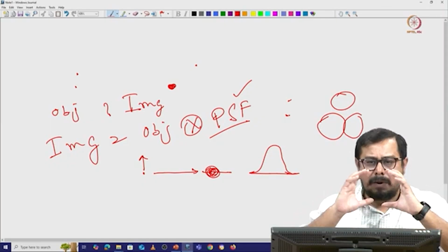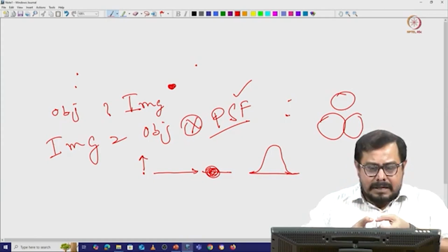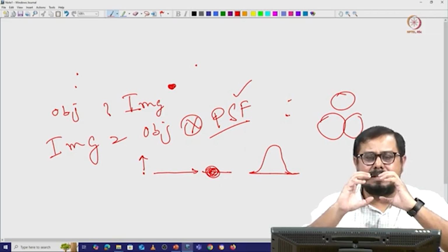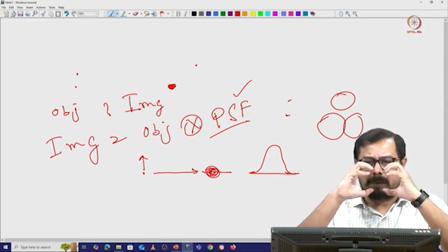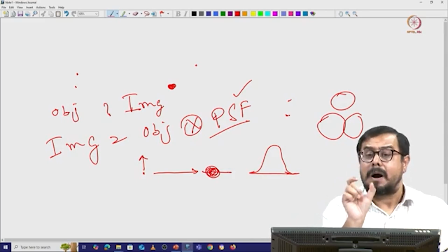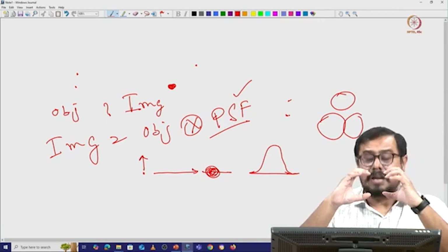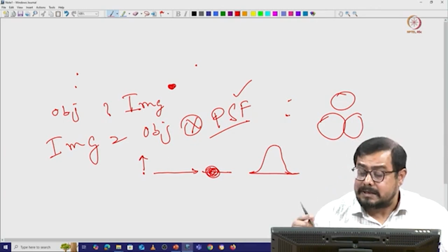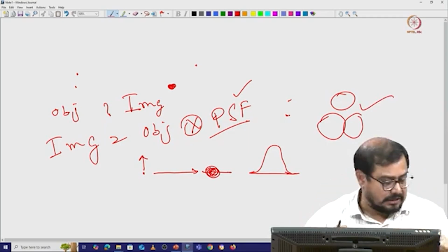It will appear like one big light is coming. But as that person slowly approaches, after a certain time you can see there are two torches and two large discs, separated. That is the point where you can tell this is the resolving power, where you can see the two searchlights or torchlights are separated. Here also we are discussing the same thing, at very high magnification.